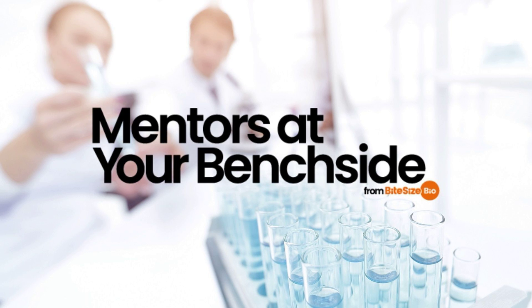I'm Thomas Warwick, and today I'll be breaking down and explaining 5 important protein quantification assays, how they work, and when they don't work. Why is accurate protein quantification important? Well, protein quantification is critical if, for example, you're trying to determine a binding constant, measure enzyme kinetics, trying to crystallize it, or if you're preparing samples for a Western blot.